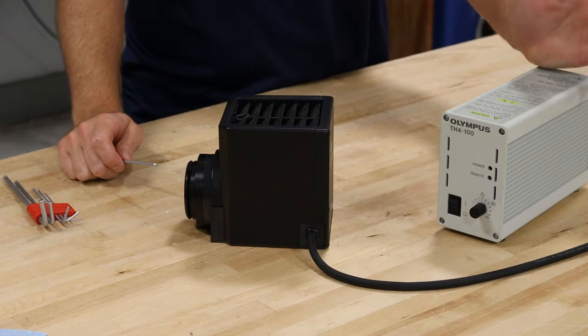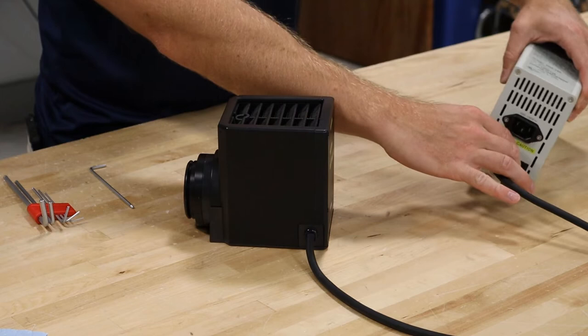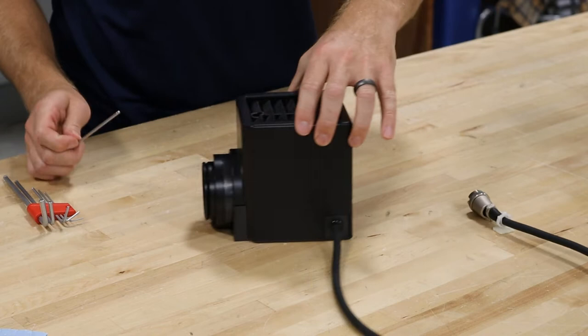Before you change the bulb, you always want to unplug the system. Make sure it's off, unplug it, and then take this connector here and rotate it and pull it out. So once you rotate it and pull it out, you are ready to go into your lamp house.